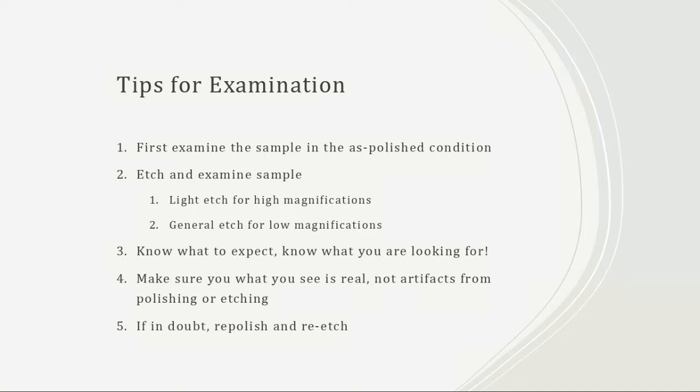So when you go to review it under the microscope, you'll see a bunch of weird looking spotted areas that do not look like they have had enough etchant applied, while everything else around them looks like it has adequate etchant. It's also helpful to determine whether or not you have porosity or secondary cracks that might be hidden after you etch the sample.